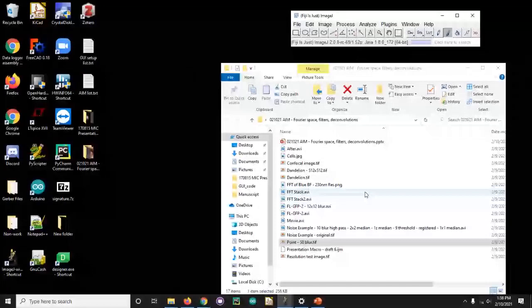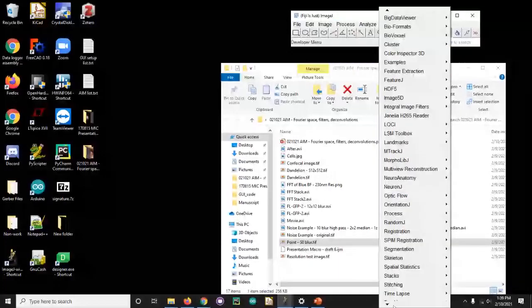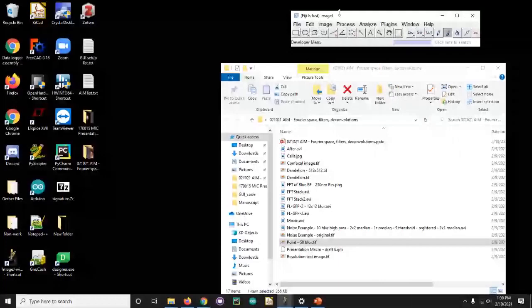Yes, yes. You wouldn't use this deconvolution tool, because this is the mathematical deconvolution. But I don't know if I have it on here, because I don't remember if it comes built in, but there is a deconvolution plugin that actually allows you to measure the point spread function, have the raw image, and there's even a point spread function generator. So even if you didn't measure it, you can have it generate based off of your optical system what the point spread function should have been. And then it'll do the deconvolution for you.